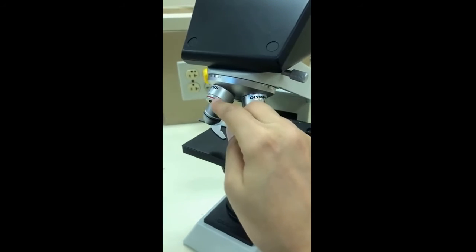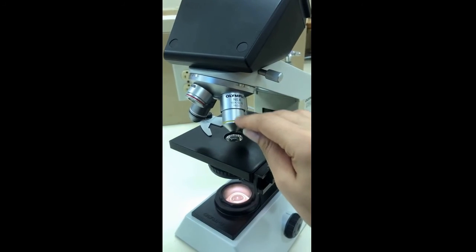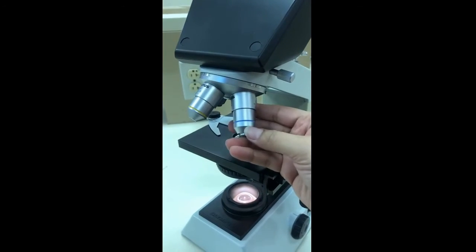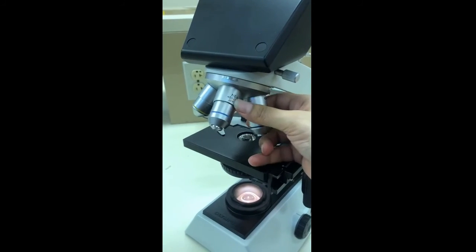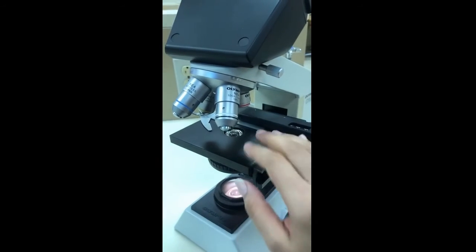Here is the first one, the red, which is 4x. Here is the yellow, which is 10x. Then the blue one, which is 40x. And here is the oil immersion, which is 100x.